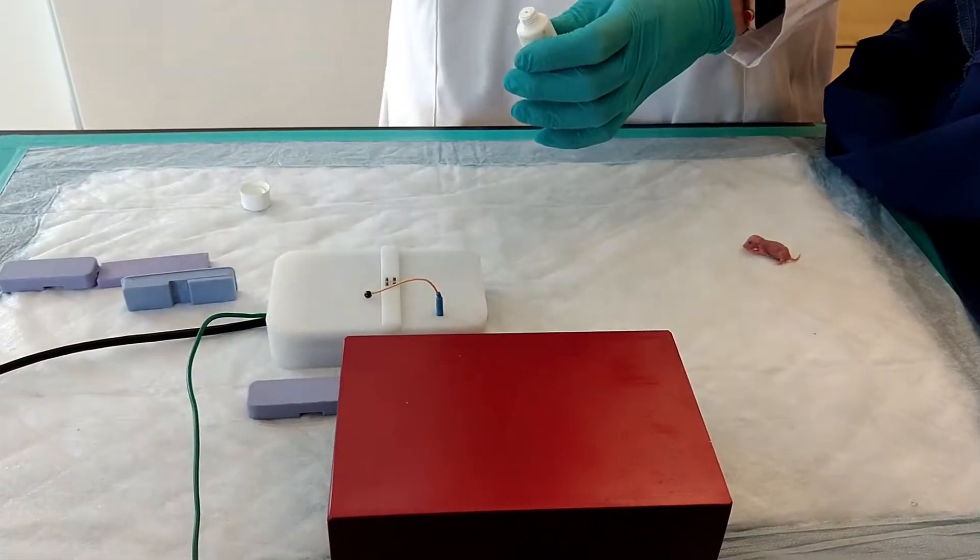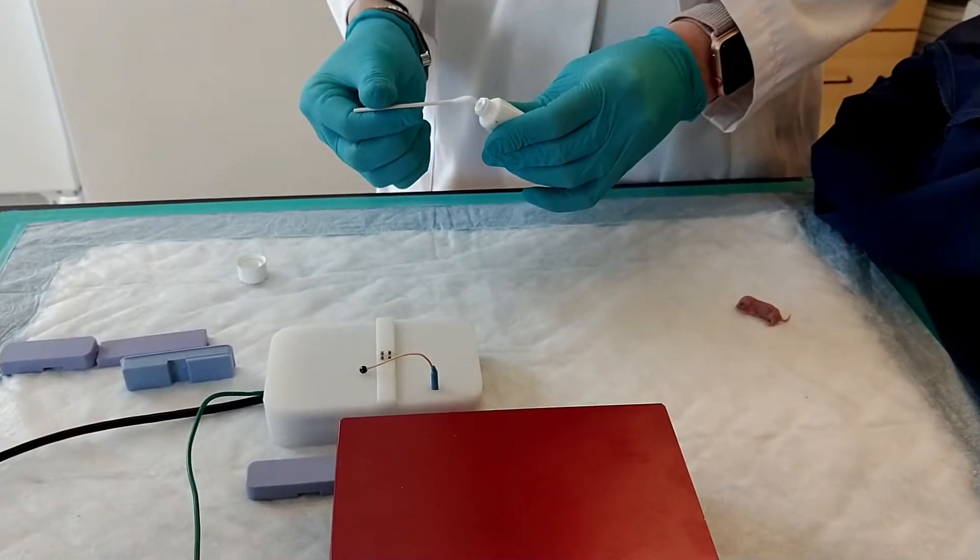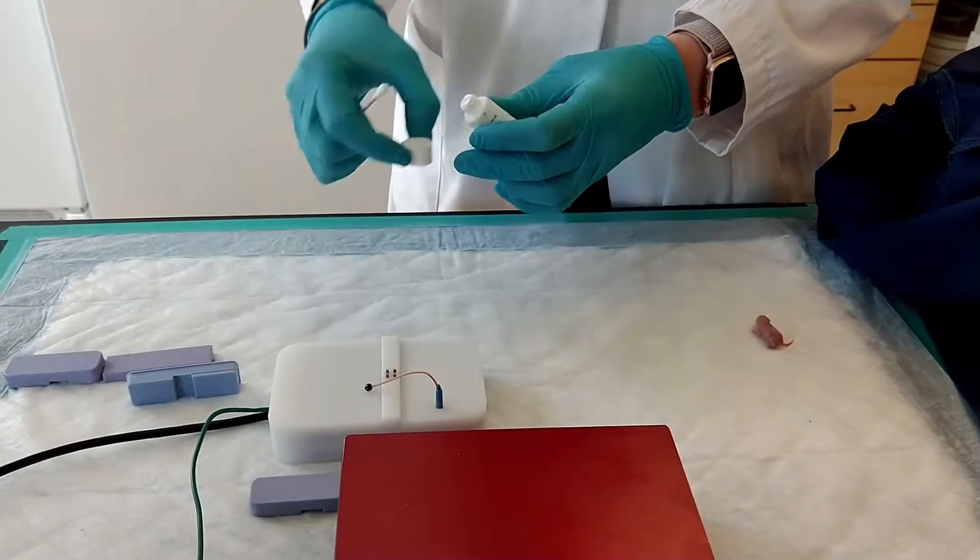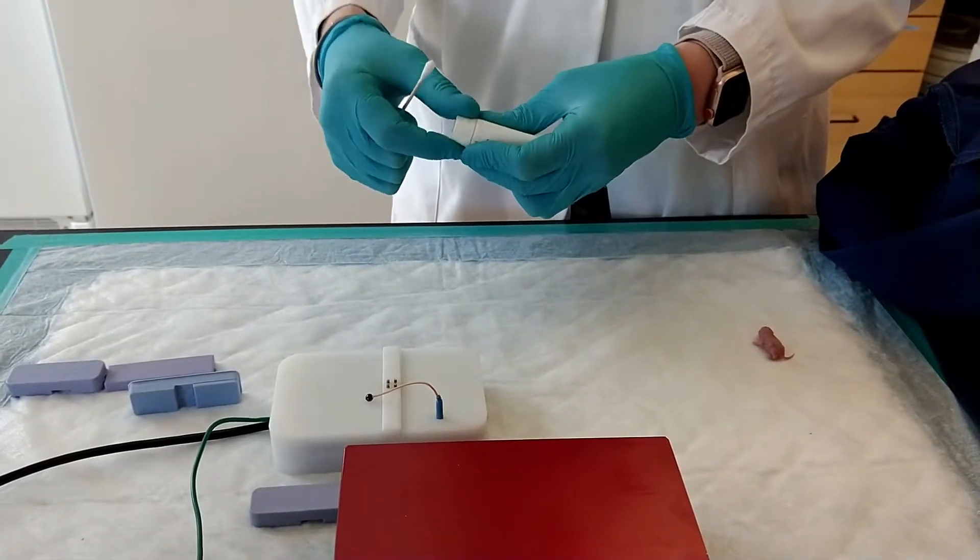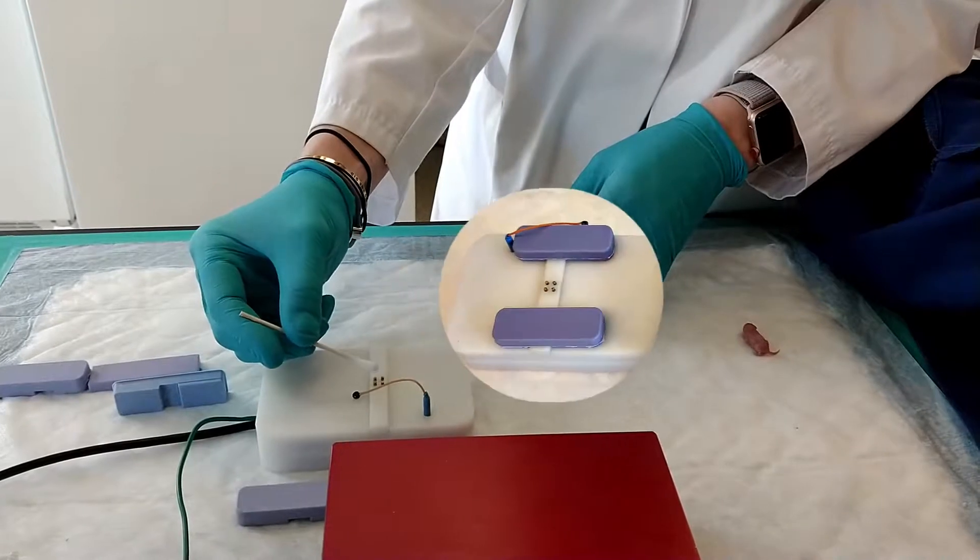Take the electrode gel, put it on a swab, and then apply it to each of the four electrodes.